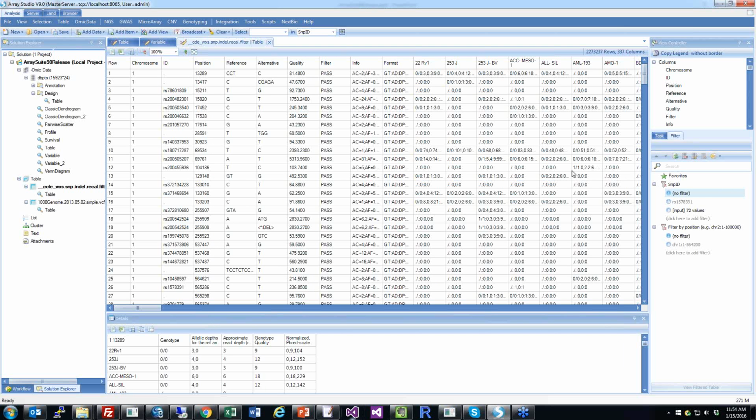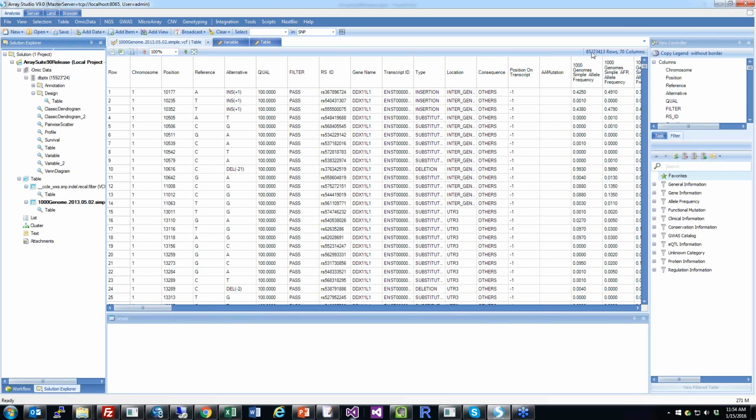So we expect this feature will be used more and more with the 9.0 release. A lot of times, this is our way to deliver huge tables. Because if you have a very big table, like in this case, you can see we have 85 million rows. So traditional ways were not able to provide anything for this table unless you are really an expert and try to do different indexing or different things.